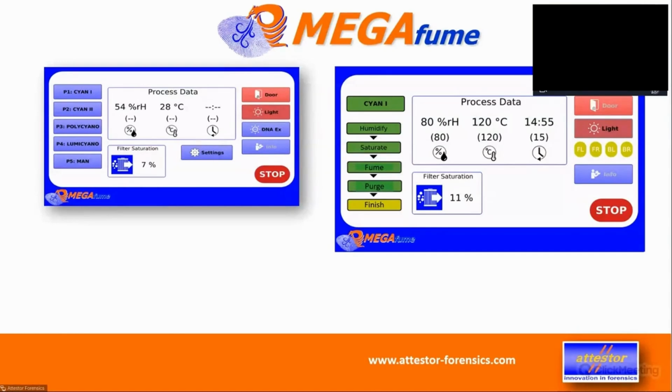And then you expose your sample, which is supposed to dry pretty fast, to undefined, uncontrolled humidity, which definitely slows down the hardening of the evidence, but could actually even blur it if the humidity becomes too much. So what we do is we go into our preservation mode till the user comes back, and preservation mode means our fan is permanently spinning with between 5 and 10% of the actual power, just to make a little bit of an underpressure into the filter, so nothing can come out of the filter. Secondly, we monitor the humidity.